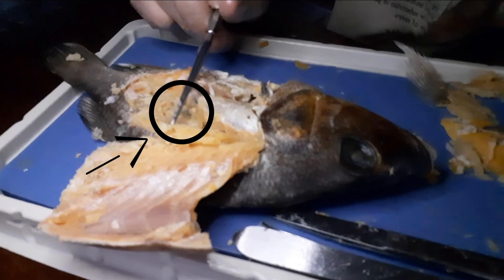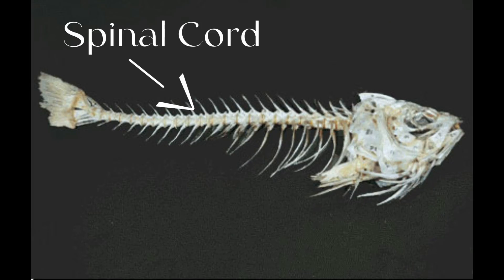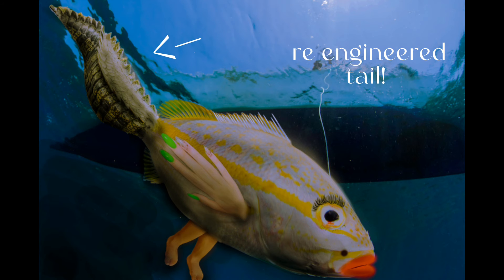Here is the spinal cord. This is what the fish's spinal cord would look like if I took all the meat, intestines, and gunk out of it. Now for the grand finale — the fish we just took apart, let's put it back together. Thank you.